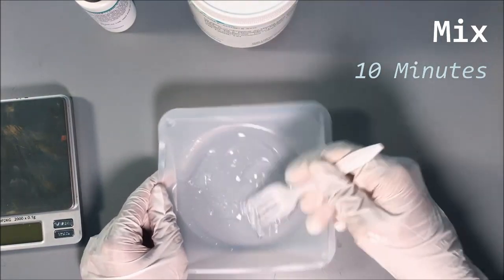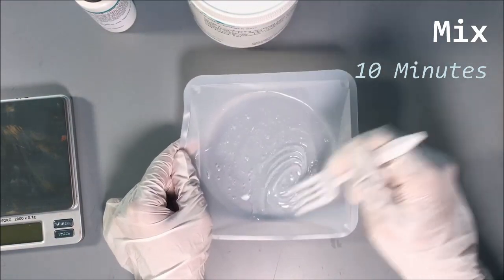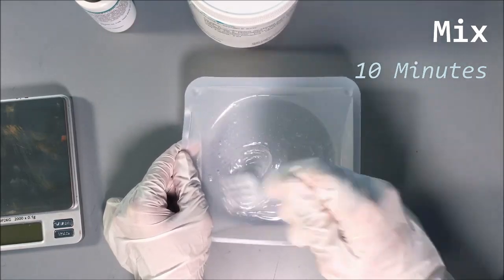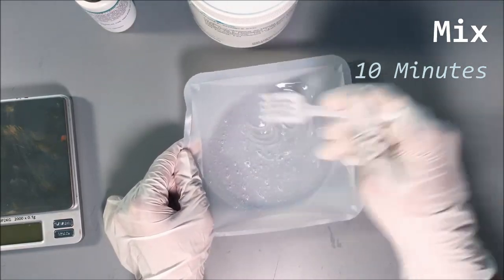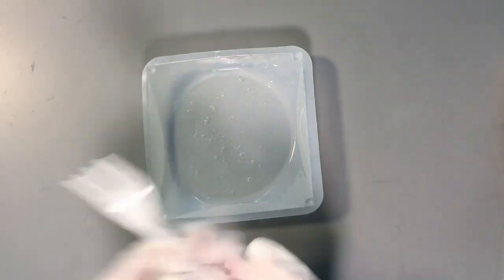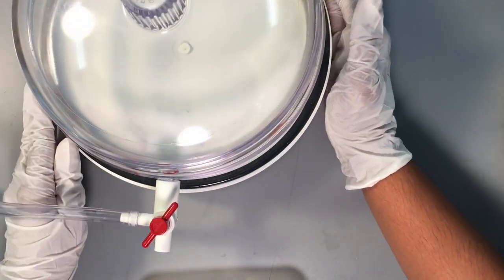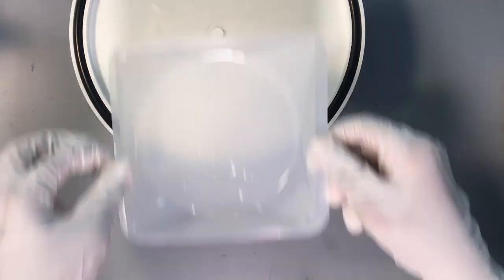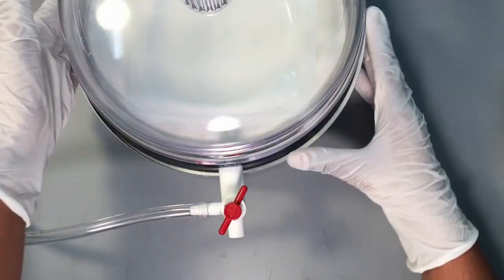Mix your base and curing agent together for 10 minutes. After 10 minutes of thorough mixing, dispose of your mixing apparatus and burst the largest bubbles you see using a pipette tip. To burst the remaining bubbles, place your weighing tray inside the desiccator and desiccate for at least 5 minutes.